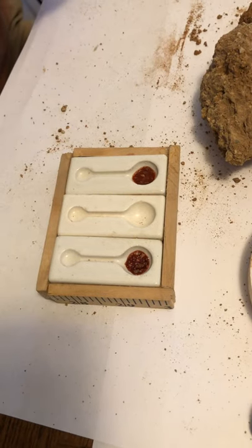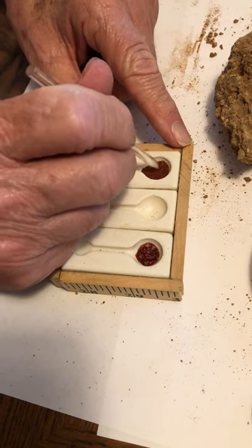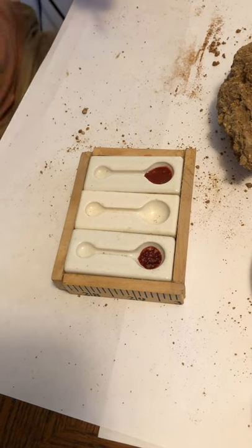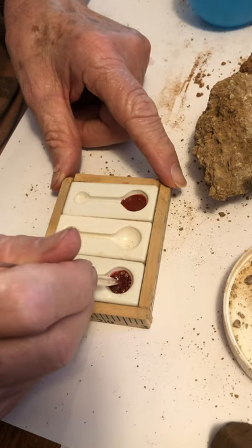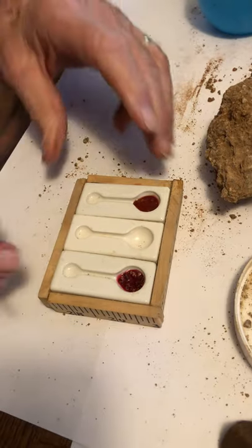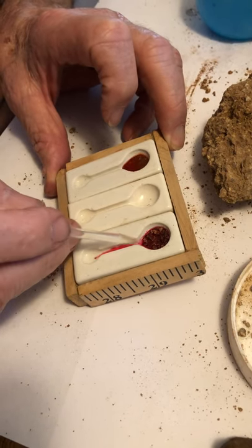Stir with an inert stirring apparatus, otherwise known as a glass rod. Between uses, clean it with deionized water so you're sure you don't get any cross-contamination between horizons. Using the magic of capillary action, we're going to draw the reagent from the large reservoir down to the small reservoir.